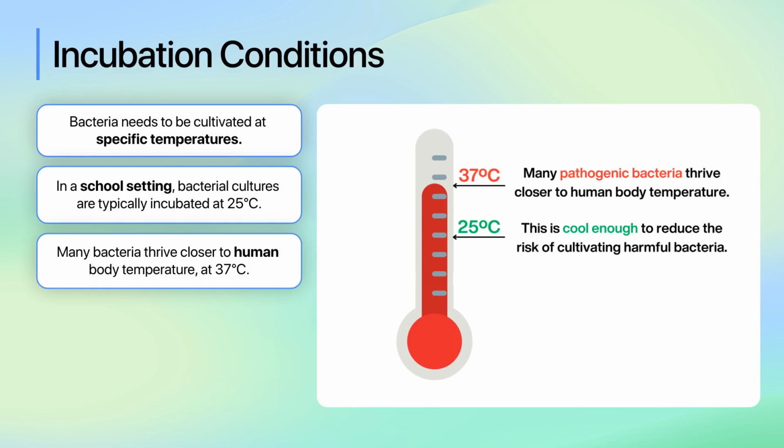By following these aseptic techniques, we minimize the risk of contamination at every stage of the culturing process. This precision is essential for obtaining accurate and reliable results in any microbiological experiment, but also ensures our safety by preventing the accidental spread of harmful pathogens.